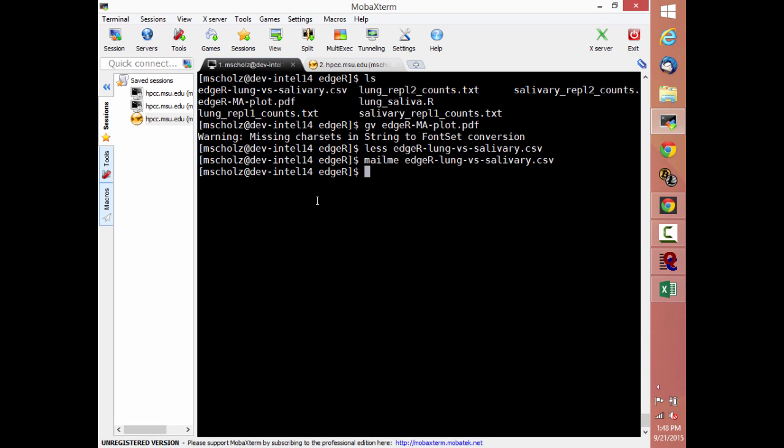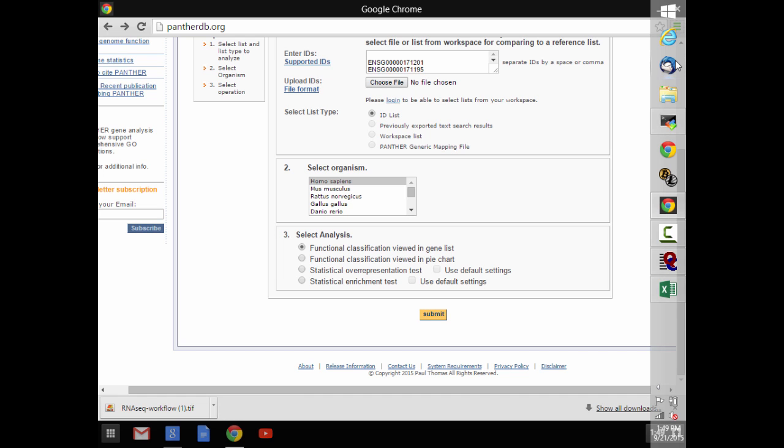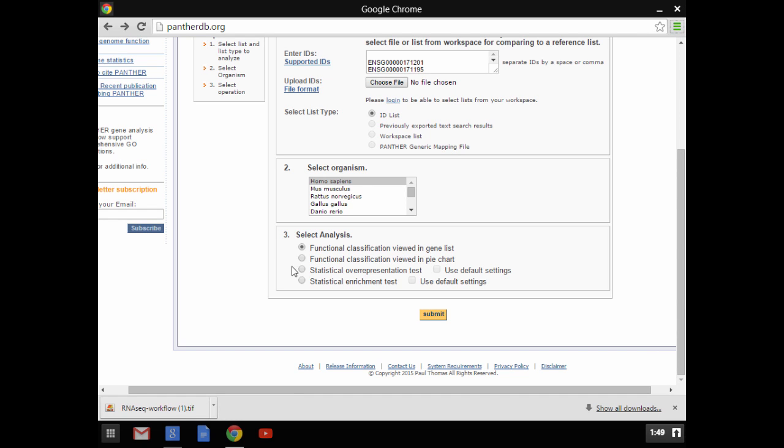The next thing to analyze would be, assuming that I have a pathway, as I do with a model organism, I can grab the whole set of data and filter it, selecting down to a certain FDR, not the top 10, but say everything below an FDR of 0.05. And we'll paste it into the same program, except we'll paste all of them, and then we can look at the next option, which is the statistical overrepresentation test.